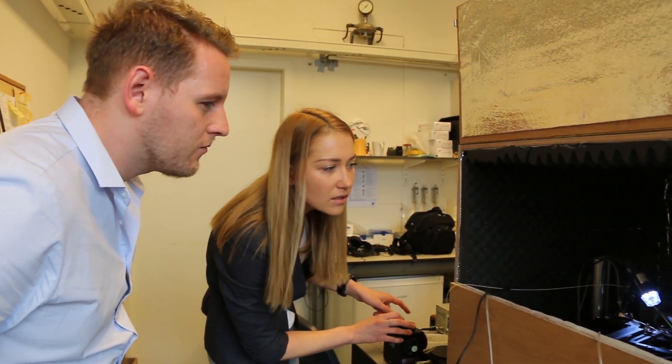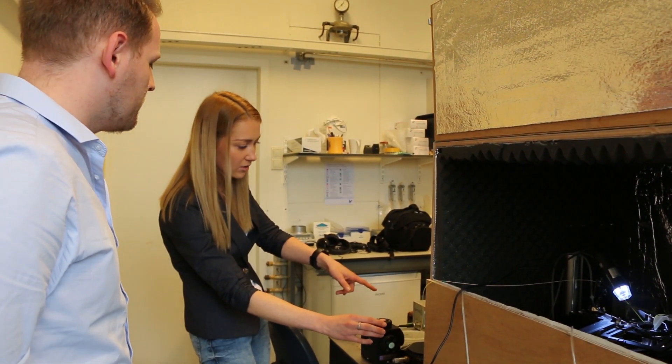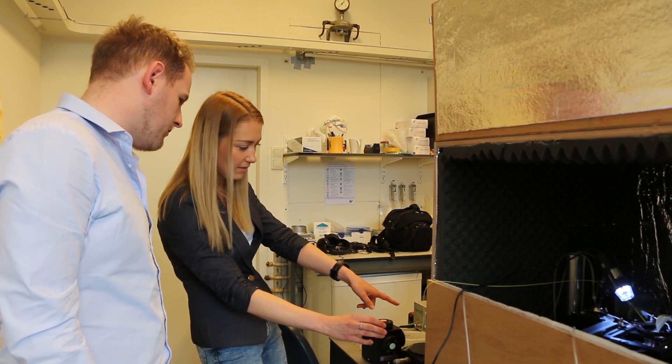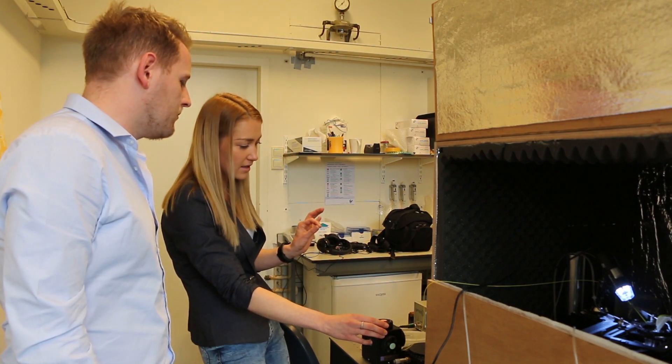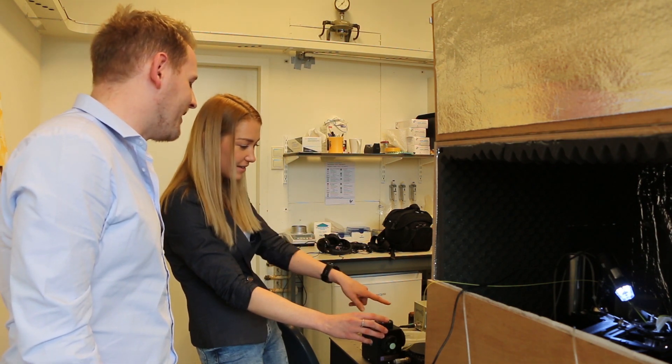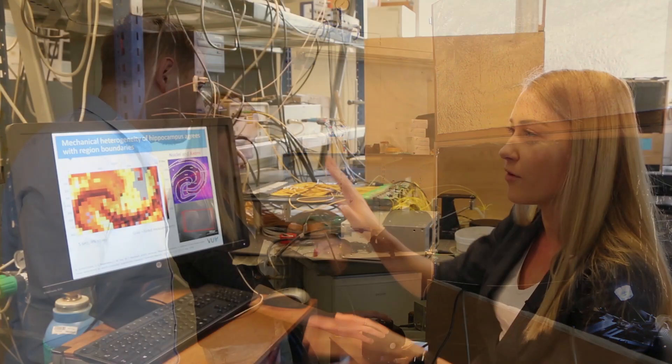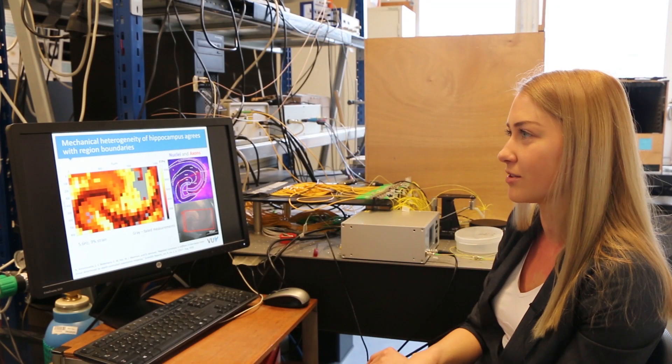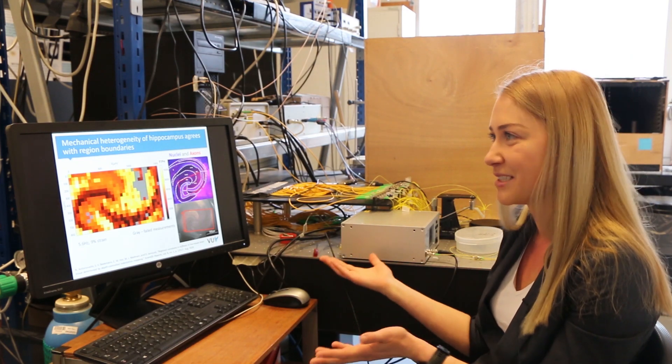So it's all pre-programmed and we can also get all the locations, information of the locations afterwards. So we read out the positions of the manipulator and that's how we can draw exactly where indentation was performed and then use that to map the staining images and so on. So it has to be really precise and scientific. These manipulators really help to implement that.